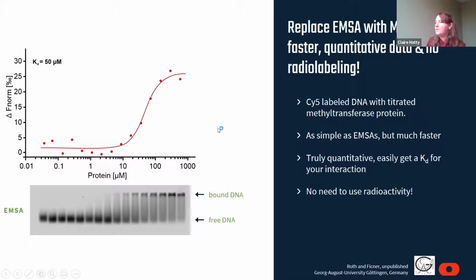So this just illustrates quickly that MST is as simple as an EMSA, but it's faster and it doesn't need to use radioactivity. And you also get a quantitative KD for the interaction.